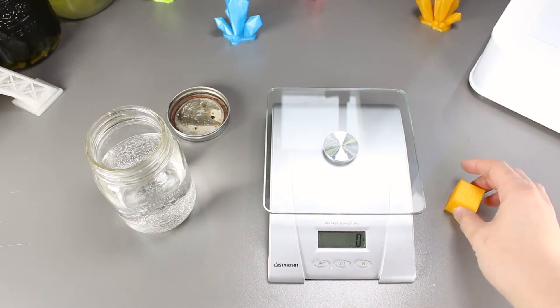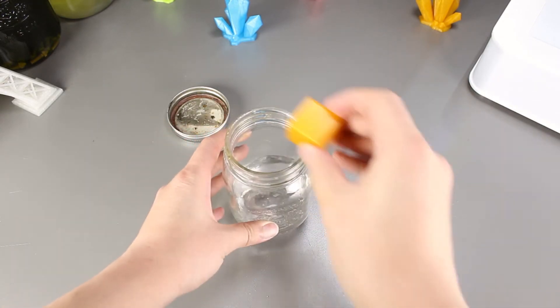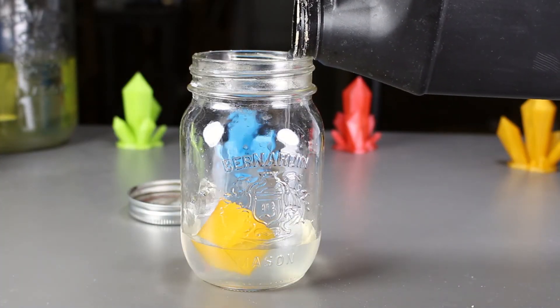It still weighs 7 grams after an hour. Now we put the PLA model back into the mason jar and then we will fill it with bacteria. Let it sit for a week.